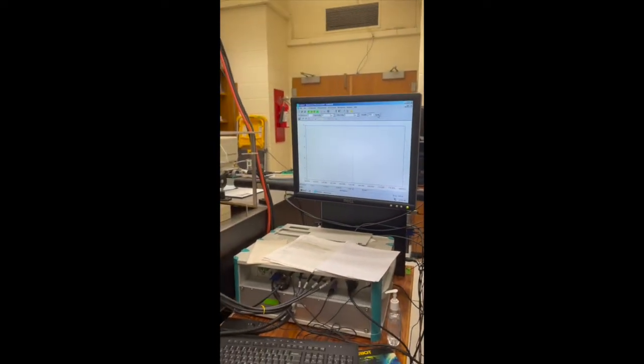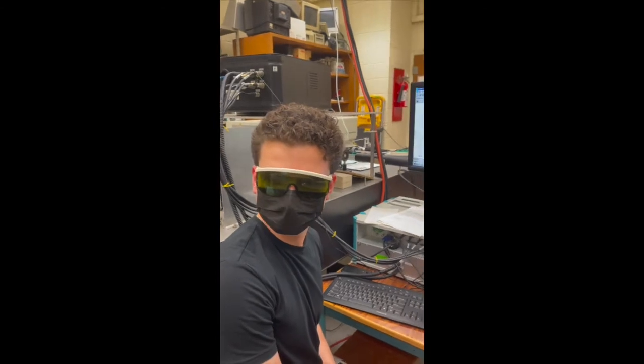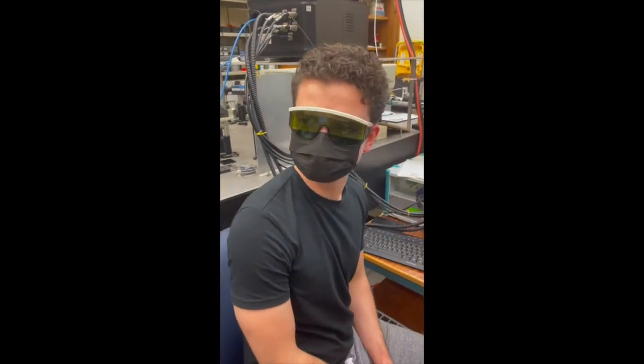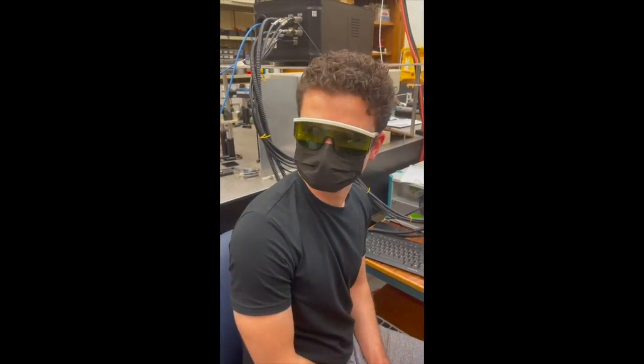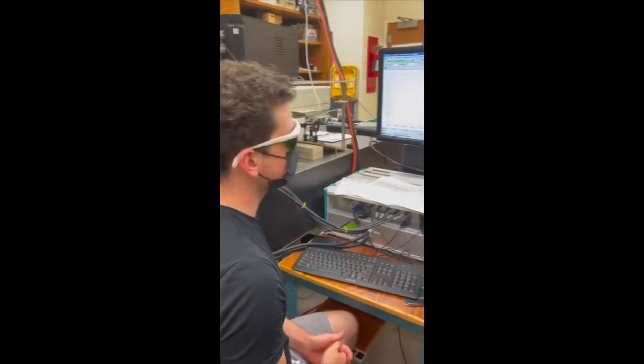So you've mounted up a piece of steel, right? Yes, I have done that. And you warmed up the laser for 10 minutes, right? Yes, that has been done. Okay, so we are basically ready to start the laser flash lamps, and we do that by hitting what we call the little lightning bolt button.